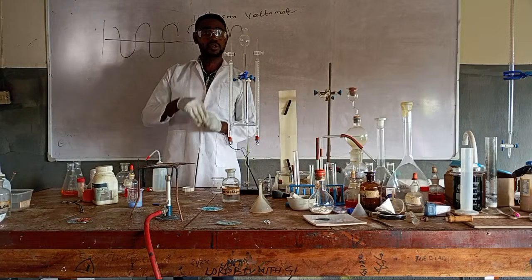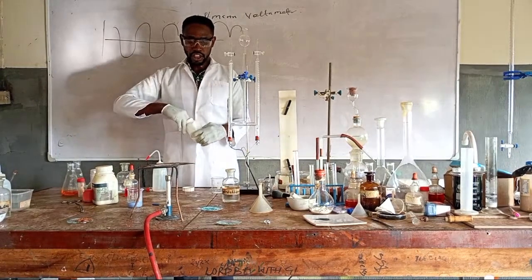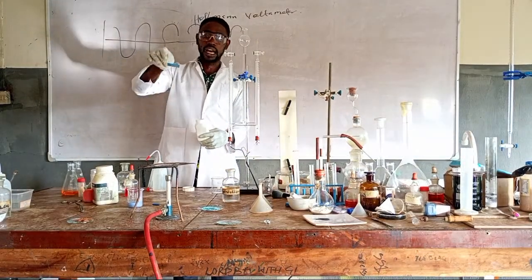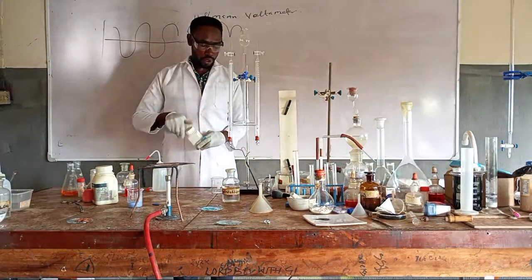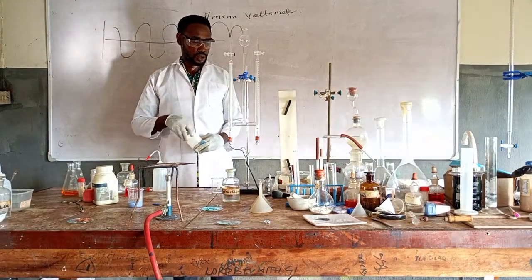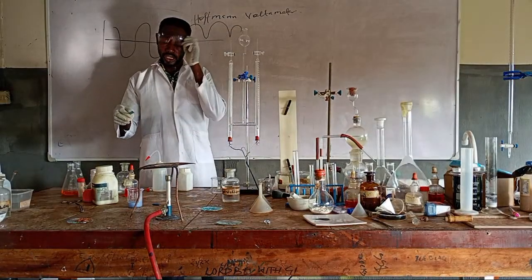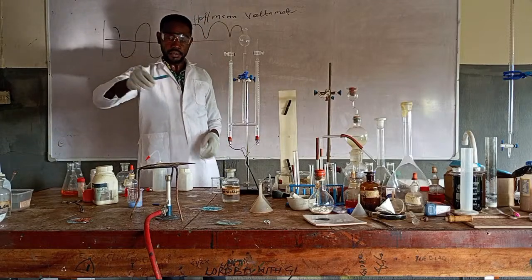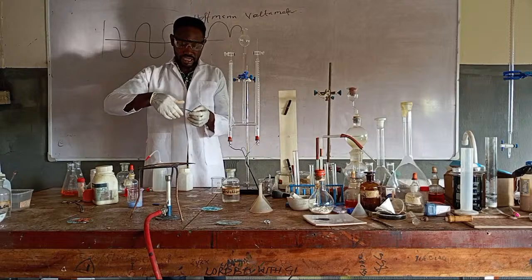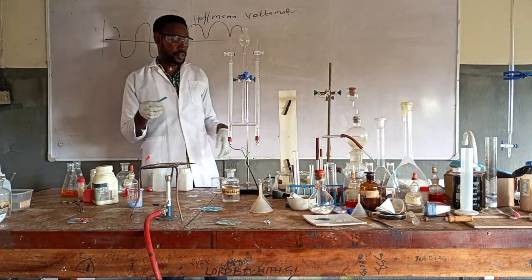With cobalt 2, this shows no water, but if I add it to anything containing water, it will turn pink. So cobalt 2 chloride paper, we can use it to test for water. Have I made myself clear? So this is not litmus paper. And maybe before you go, if you take this and keep it, before morning it is already what? Pink. Morning is even too far.